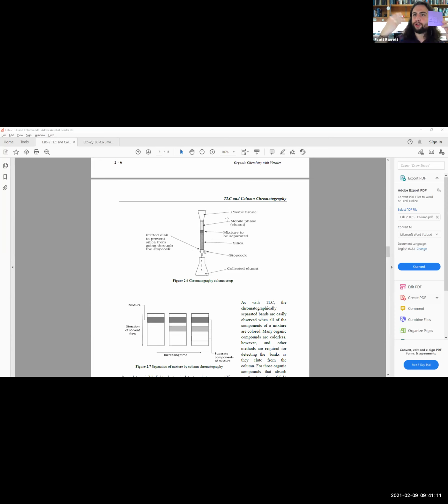So you'll start running your solvent, having multiple vials going. Let's say you have 100 of them. Well, the first 10 will be extremely nonpolar, your first very nonpolar compound. And then as you go, it goes more and more polar, and you can switch up your solvent. You can make your solvent a little bit more polar in order to start eluting out your compound from it.